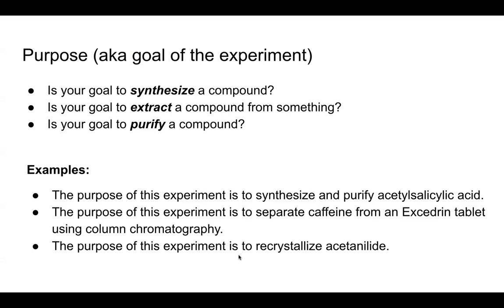In this last example, the purpose of this experiment is to recrystallize acetanilide. This is a purification technique. Recrystallization is a purification method. And so that is the goal of the experiment. Okay. These should be generally one sentence long, quick snippets.